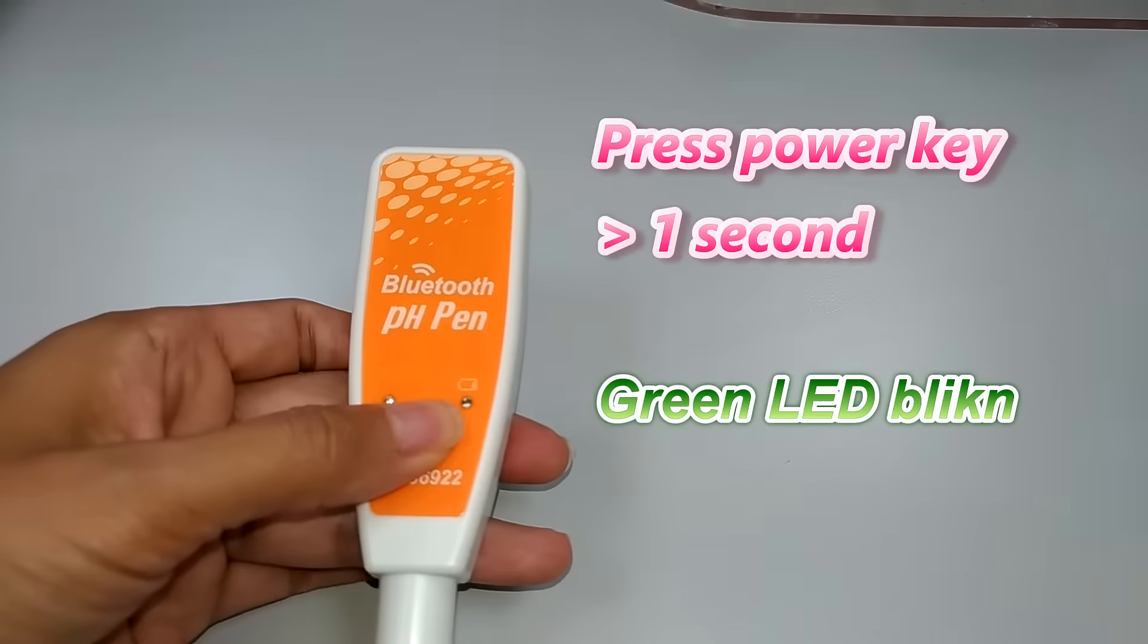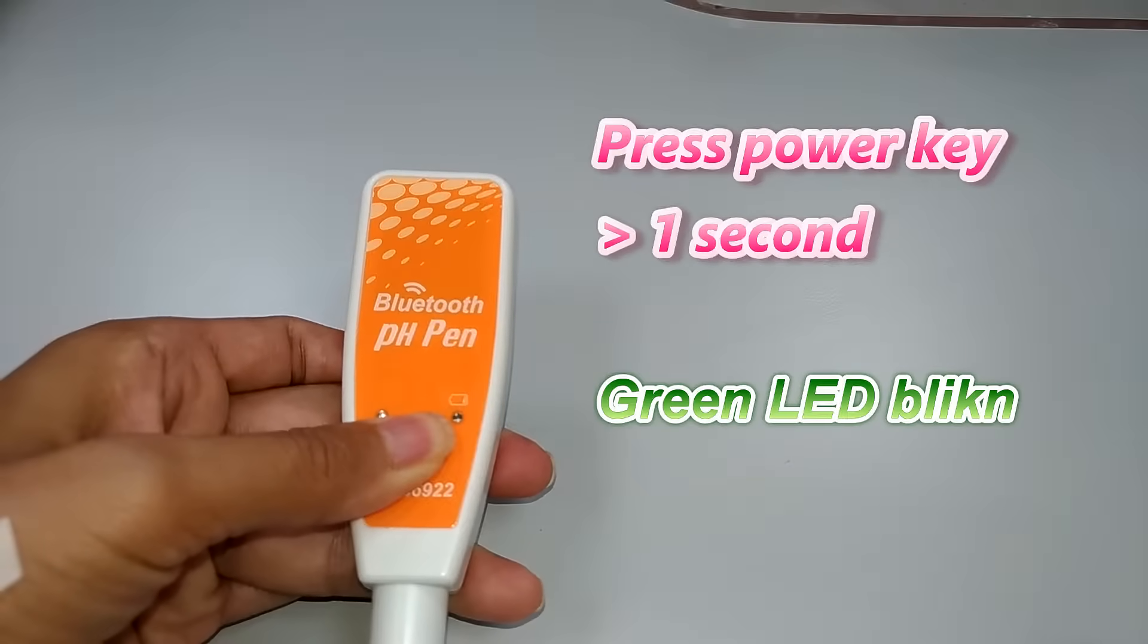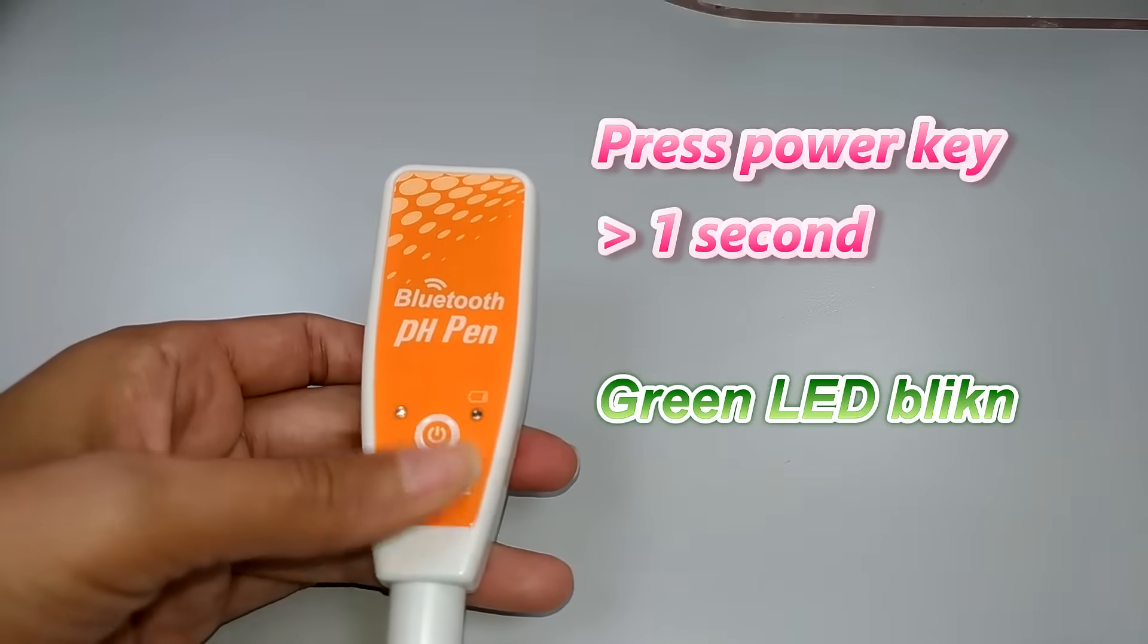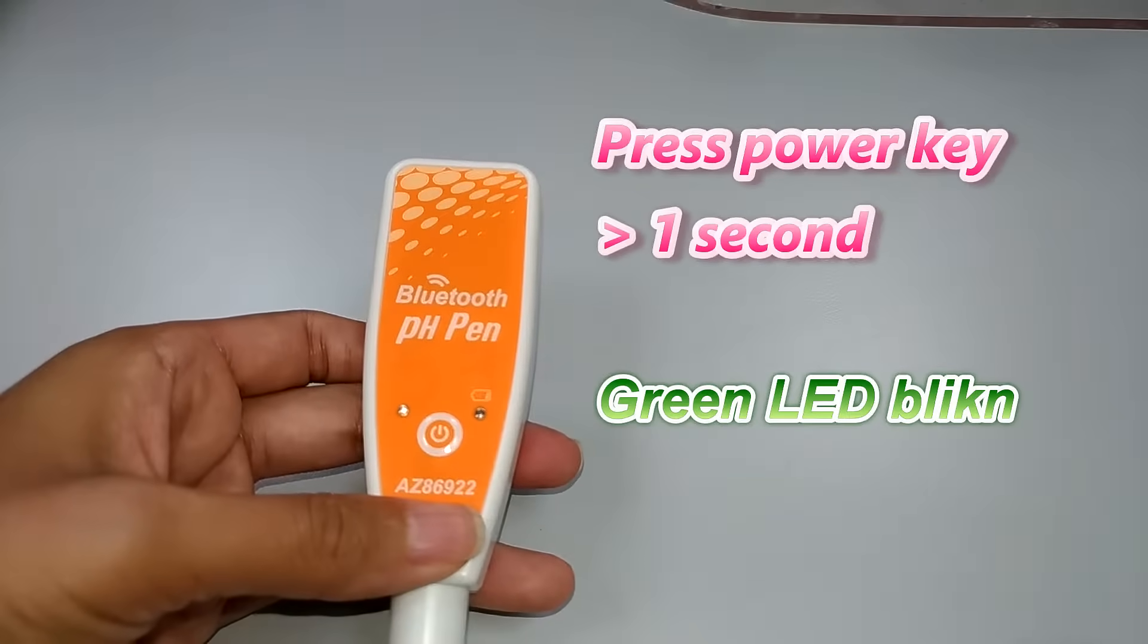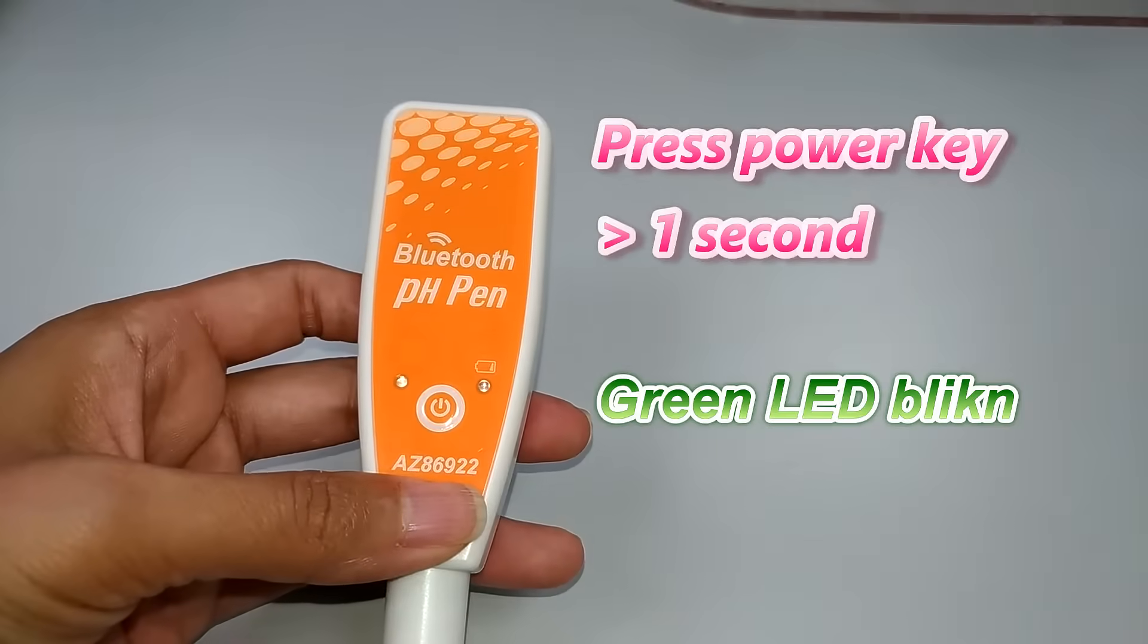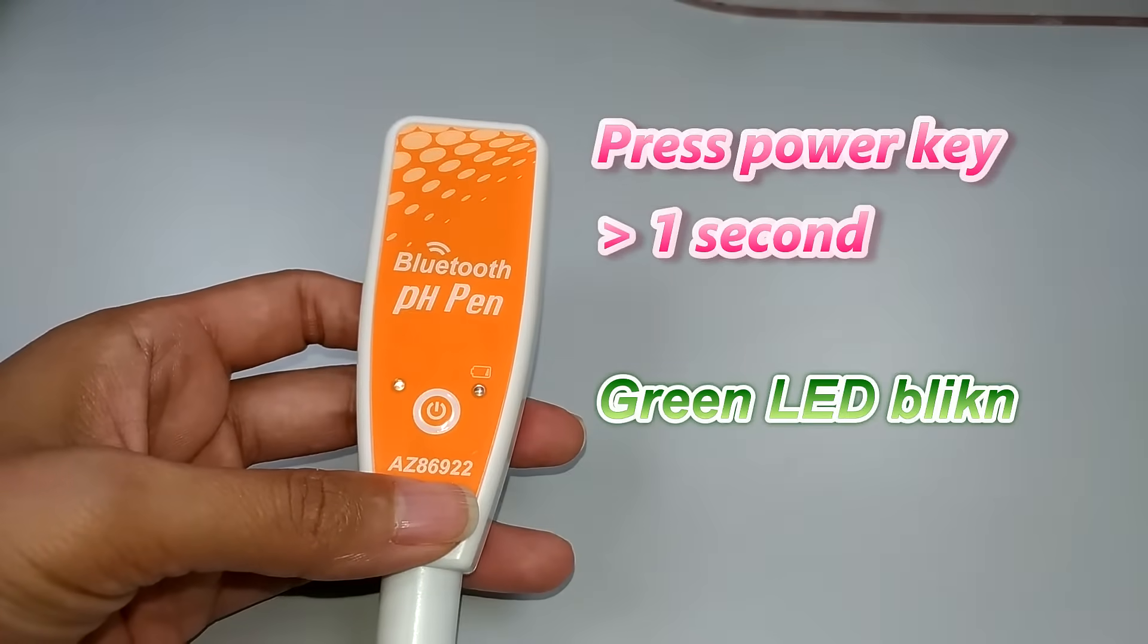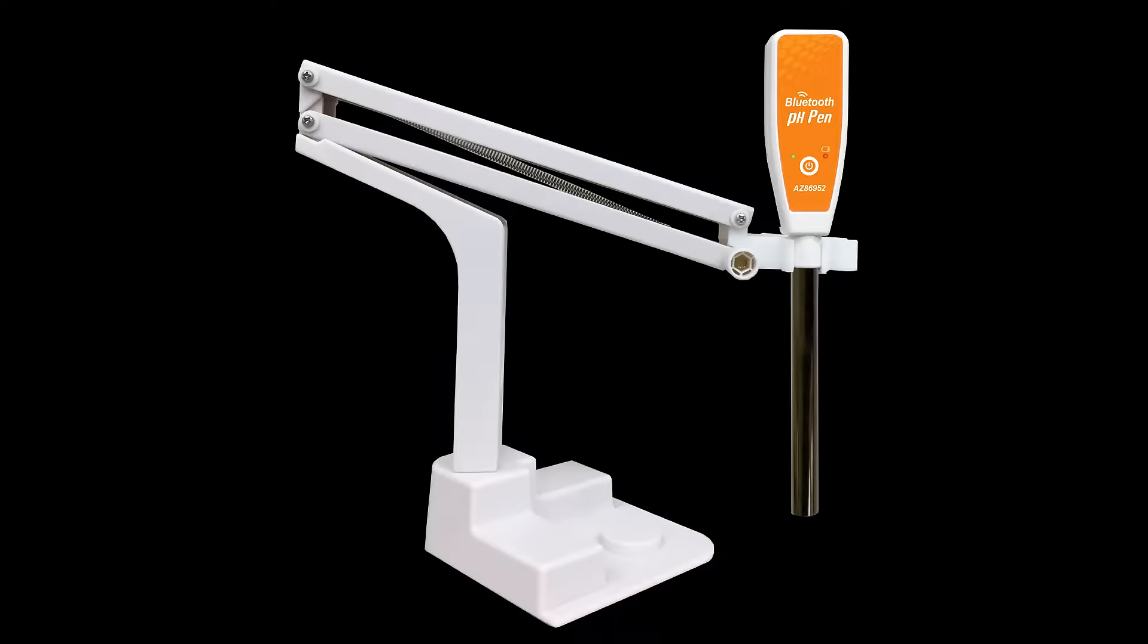Press power key more than 1 second to turn on the PH Pen. You may use probe holder to hold at most 3 PH Pens.